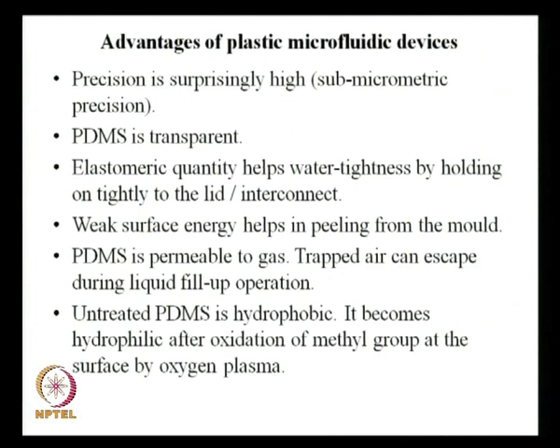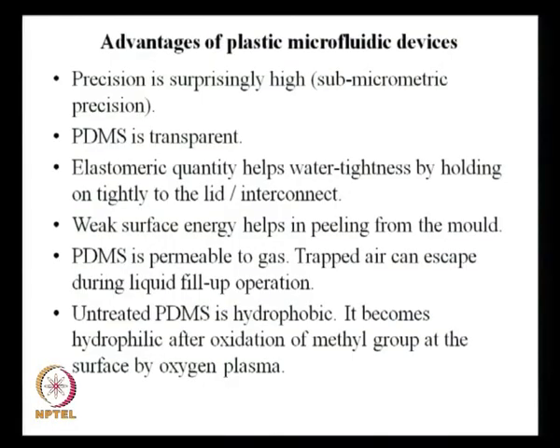You might have already seen, while we assemble toys, there is something called a press fit connection. You press it, it shrinks a little bit, goes in and then fits there. This is called a press fit connection, and it is possible because of this elastomeric quality of the material. So that can be utilized here to put some interconnects, some tubes on this.